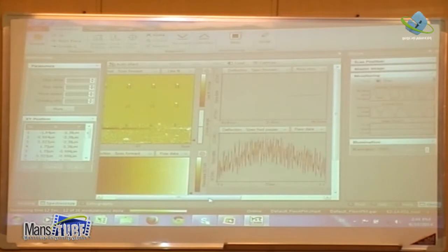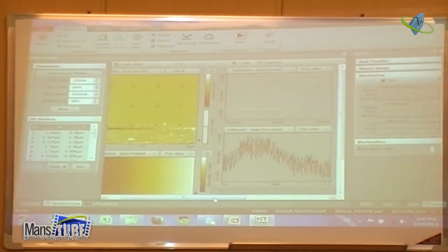Then you see this is the position, minus 300 of my piezo. This is minus 600. And you see how it's moving up and down. This is the deflection also because it's related. Then you can see you have the spectroscopy, and maybe sometimes it is short, not long enough. And then you see here it is retracted to minus 275. So this you can really monitor in the spectroscopy. Maybe it's a little bit difficult, but yeah.